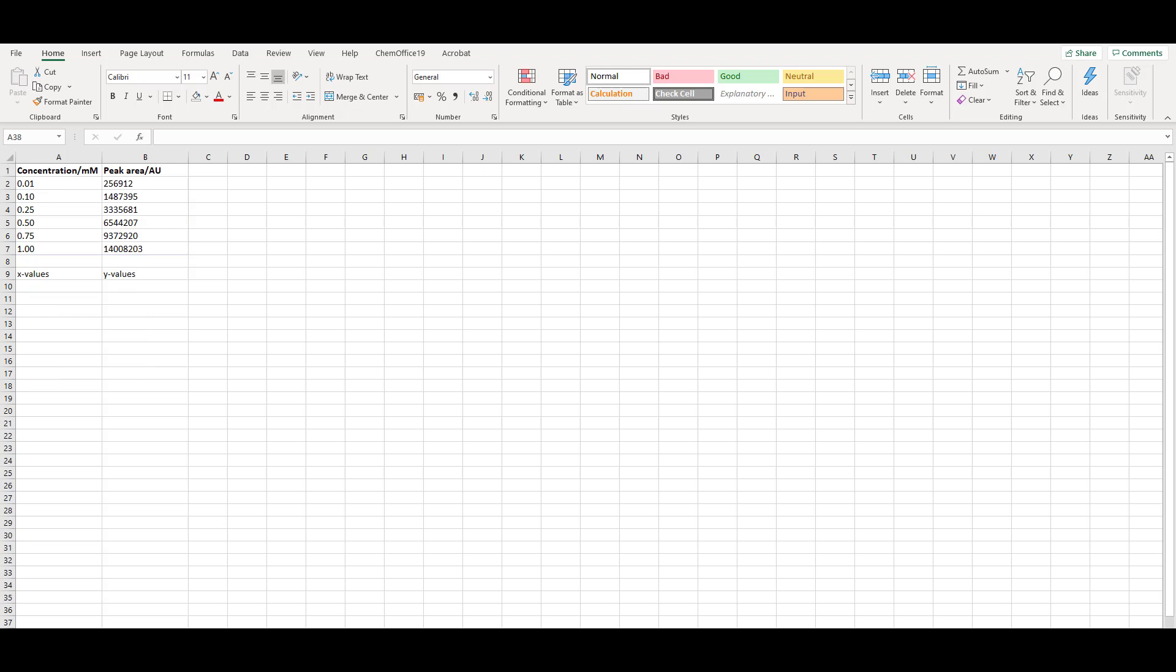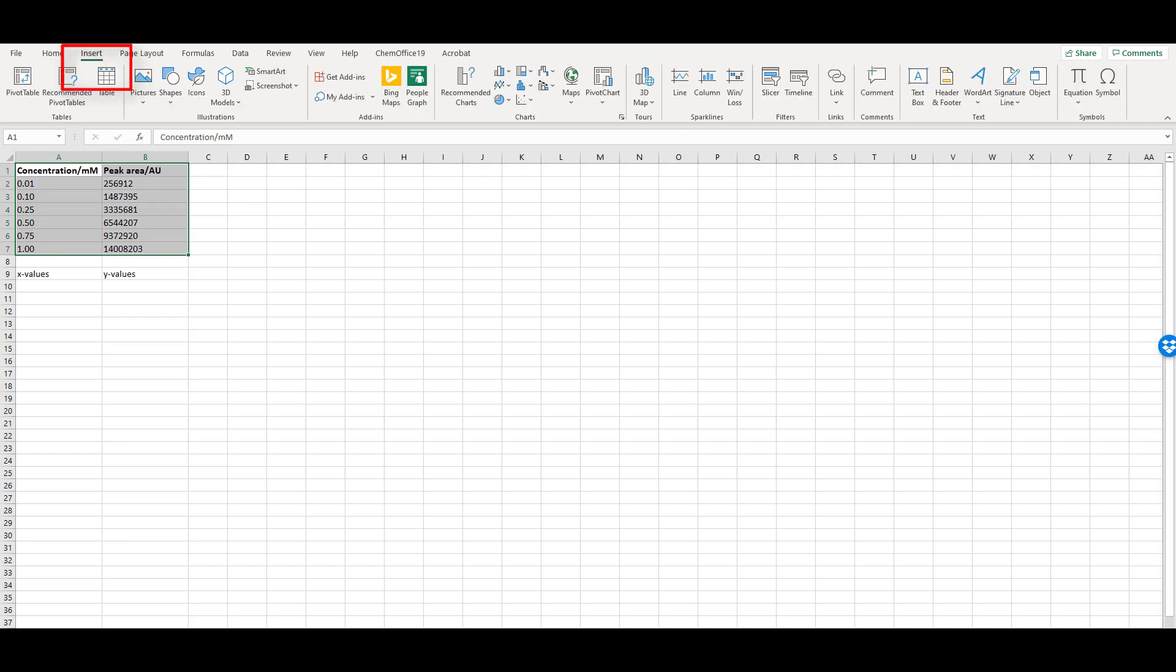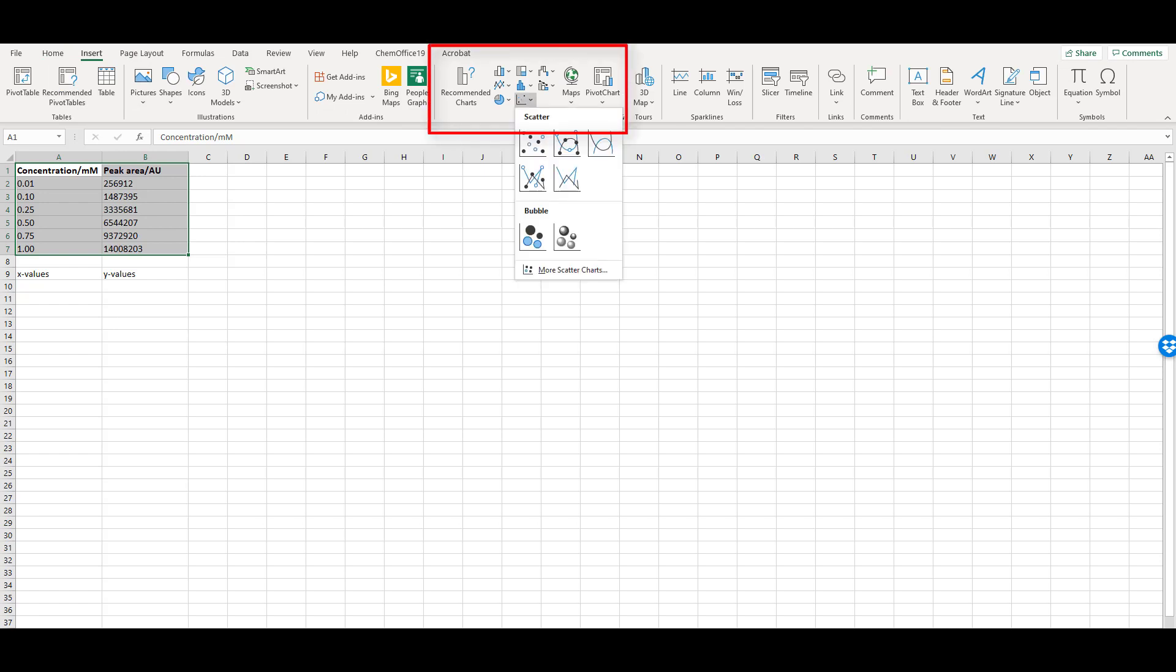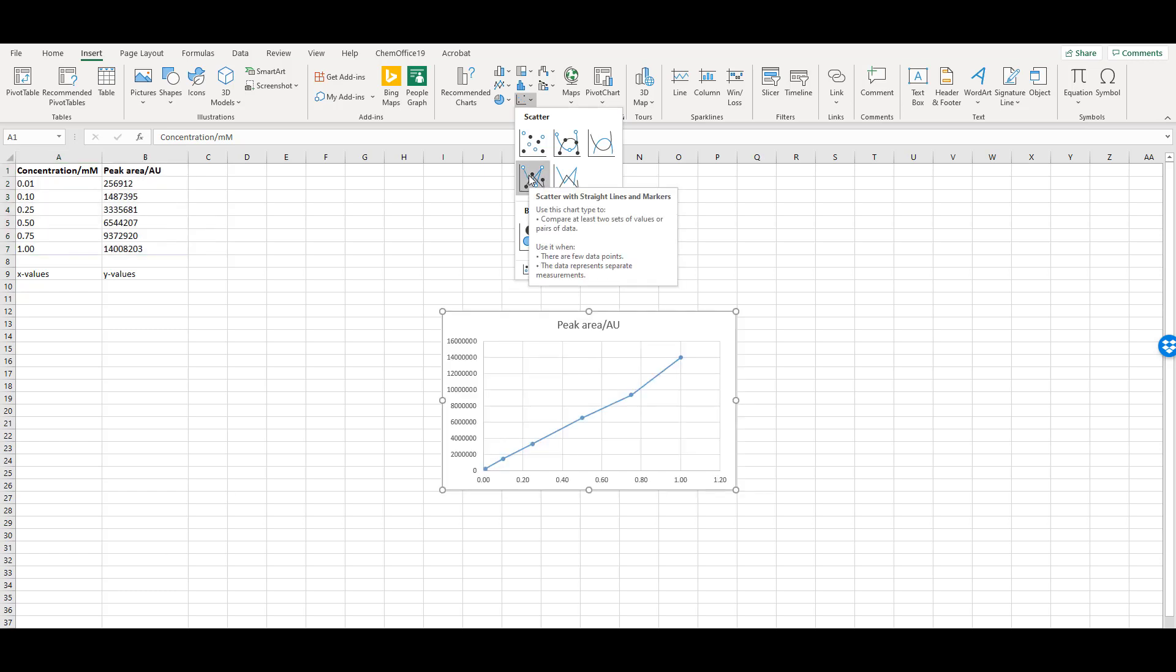Highlight the data and go to the Insert tab. In the Charts area, select Scatter. I prefer to use Scatter with straight lines and markers. It's not normally appropriate to use smooth lines on a calibration graph.